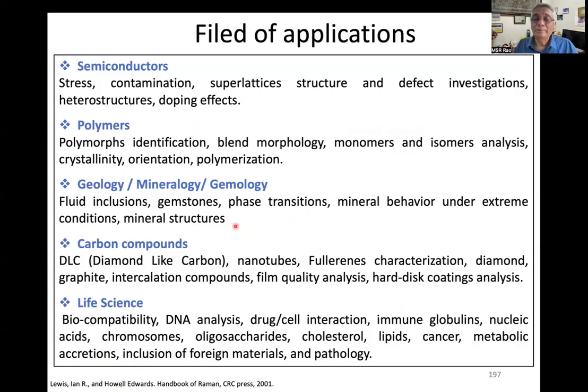You pick up some minerals or crystals from natural sources, and you quickly want to see what that crystal is made of. So you do a quick, even with handheld Raman spectrometers, you do the Raman spectroscopy, and then compare it with the signature patterns, and then you know whether it's a pure mineral or mineral mixed with some other components or compounds.